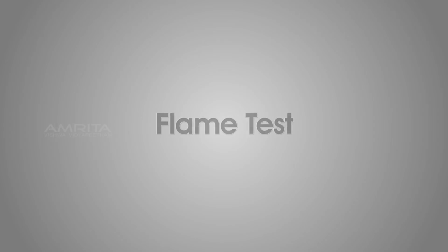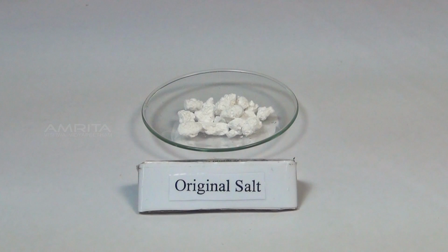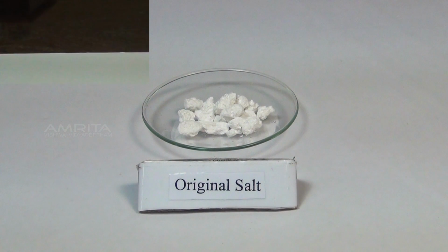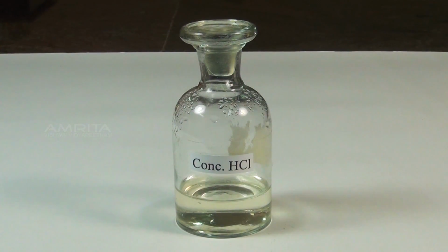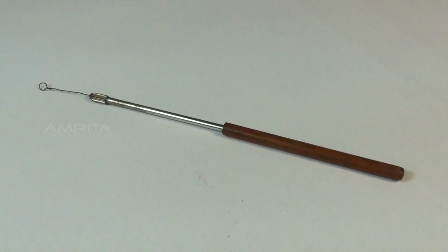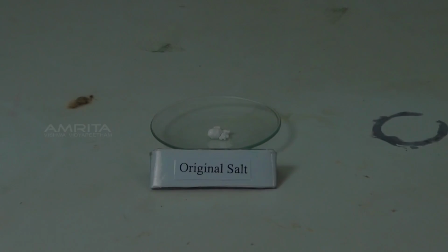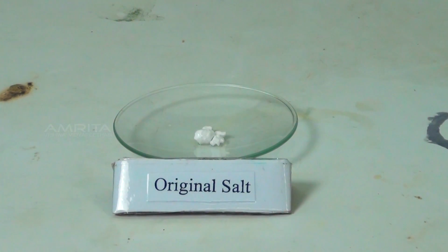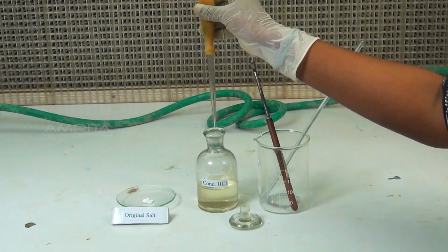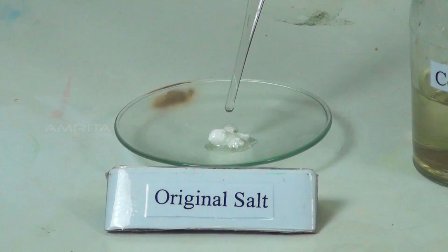Flame test. Materials required: original salt in a watch glass, concentrated hydrochloric acid, dropper, glass rod, platinum wire loop, and Bunsen burner. Procedure: take a small quantity of the salt in a watch glass. To this, add a few drops of concentrated hydrochloric acid using a dropper.